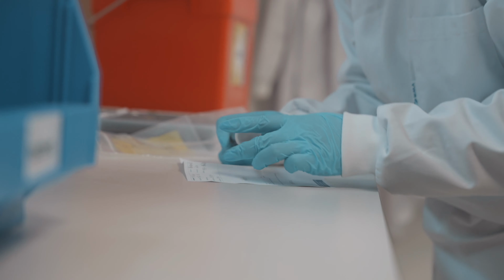So they'll start by initially sorting the samples, then they'll be labelling them up with a barcode, a bit like a tin of beans, so that we can book it into our computer system, and then we'll know what to do with the sample as it progresses through the laboratory.